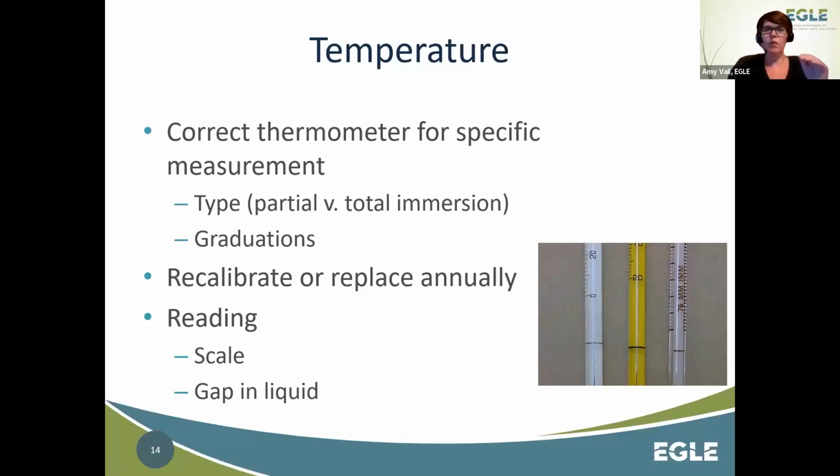For example, this thermometer reads 0.1 higher than the NIST, which is a specifically certified thermometer. You could then use that thermometer in the future, you just need to know that every time you take a reading, it's 0.1 higher than it should be. Usually they'll have some type of tape on the thermometer that tells the staff how to do that.